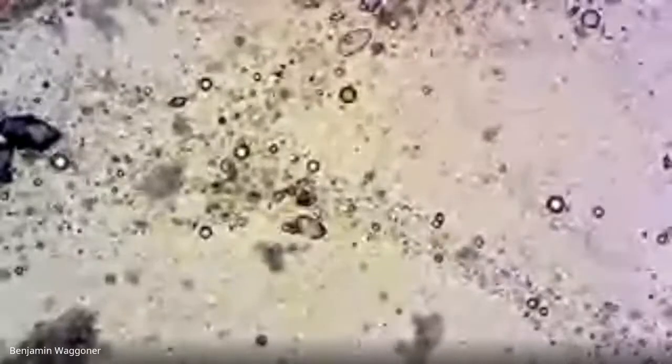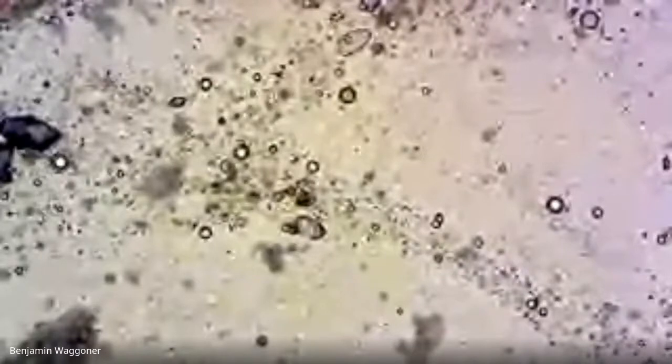One very common thing that people find is gregarines. If you remember, we talked about those briefly yesterday. There's lots of little bacteria and things in here. Gregarines are those apicomplexans. They're cousins to malaria and things like that. They have what looks like a head end and what looks like a body end. And those are fairly common. If you didn't catch them in the lecture, as I said, I will send out some pictures. All right, I'm going to go out of focus a little bit again to try to zoom in on something cool.